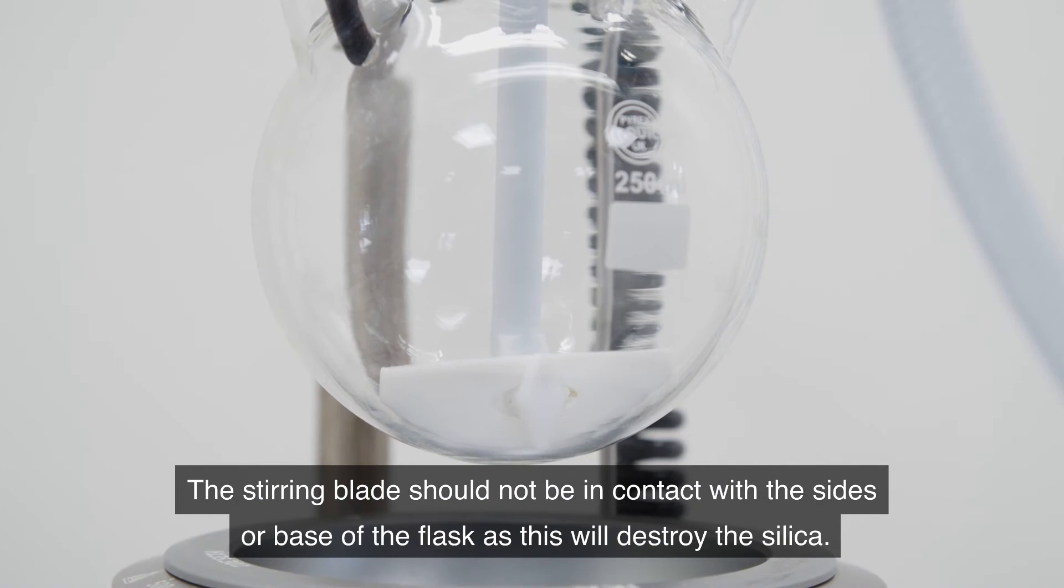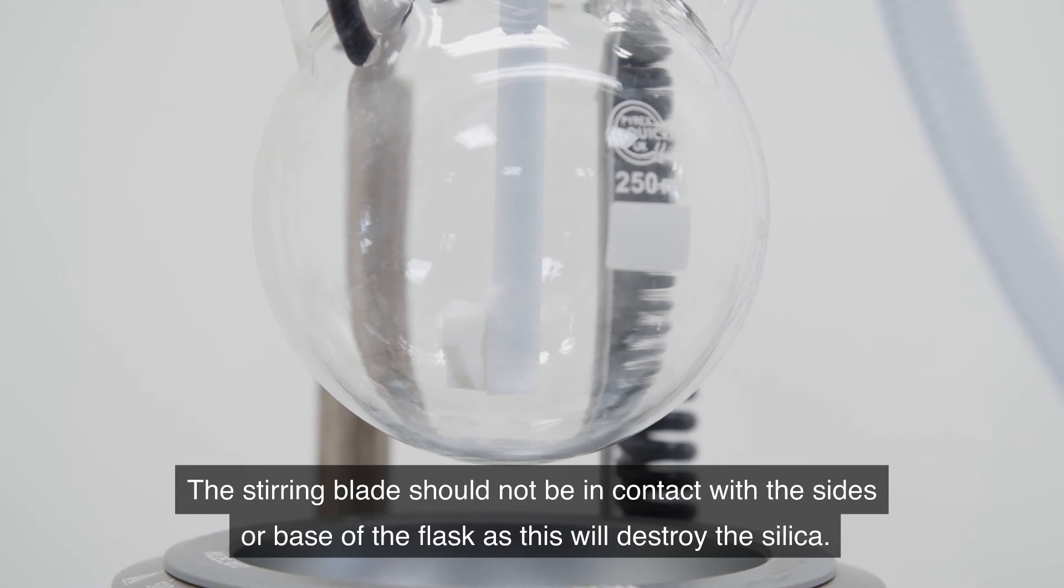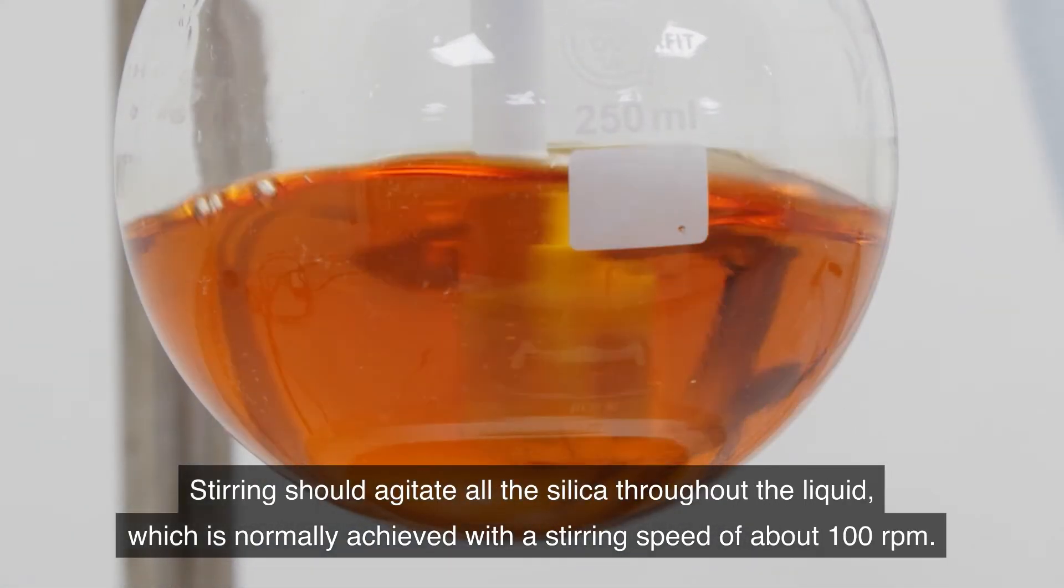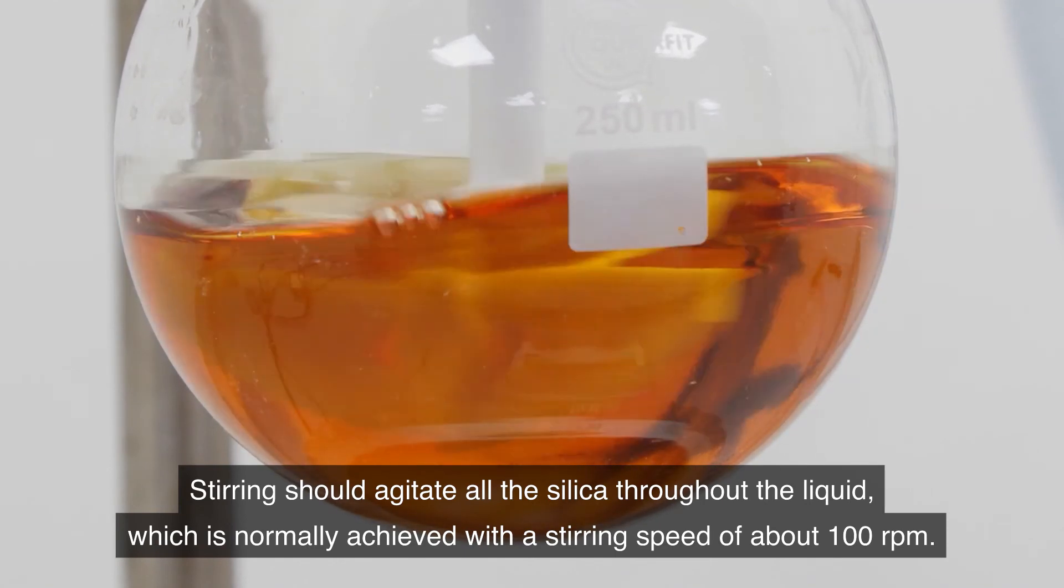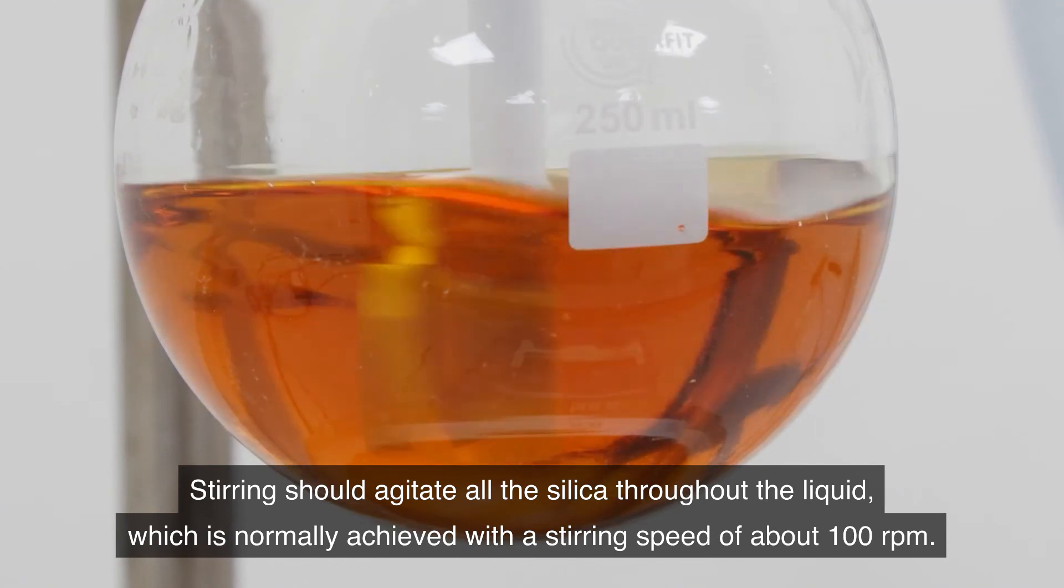The stirring blade should not be in contact with the sides or base of the flask as this will destroy the silica. Stirring should agitate all the silica throughout the liquid which is normally achieved with a stirring speed of about 100 rpm.